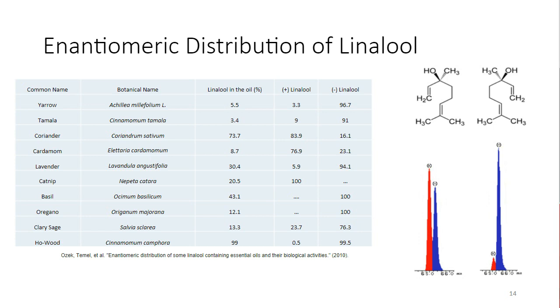Right, so definitely in the plant it will be the same or similar, but if the process alters, that will be a different story. If you are expecting steam distilled oil and you are looking for a certain chirality, it will be the same, right? Or if it differs, that means it could be hydro distilled, or it could be a synthetic addition, or an addition from some other plant material, which you can see.